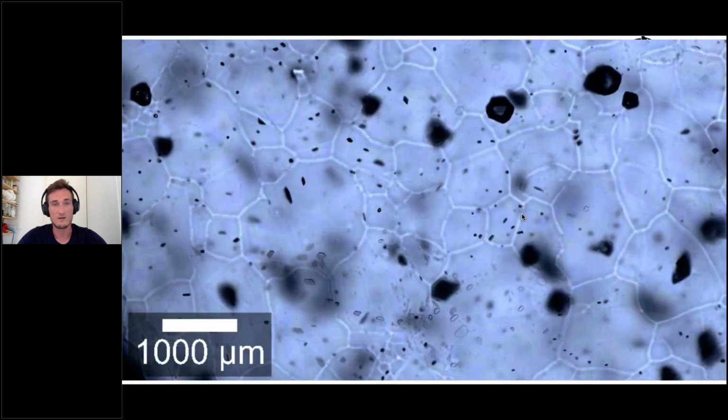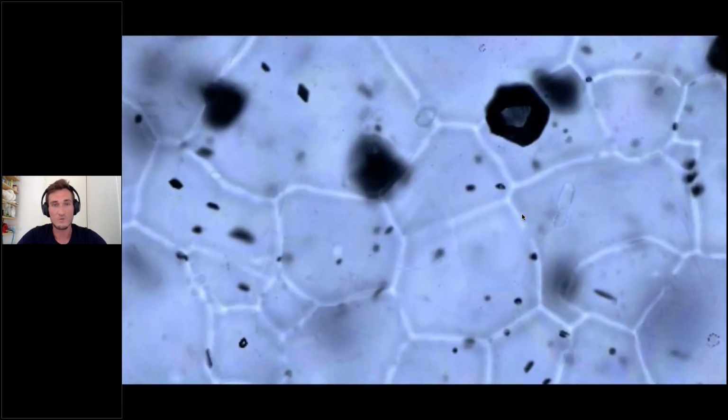Okay, here again, just the overview about one of the samples. So this is what it looks like inside your sample, roughly 500 micrometers below the surface. You still see some traces of the grain boundaries and some air bubbles, some clathrates. And when you zoom in, those very tiny little dots, they are the inclusions we are looking for.